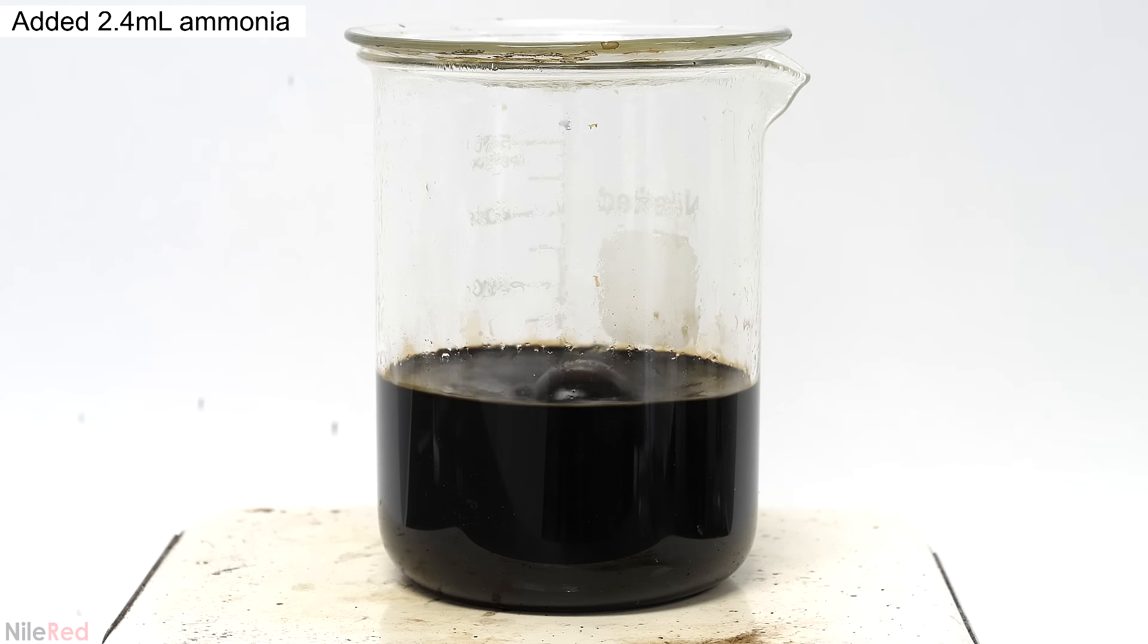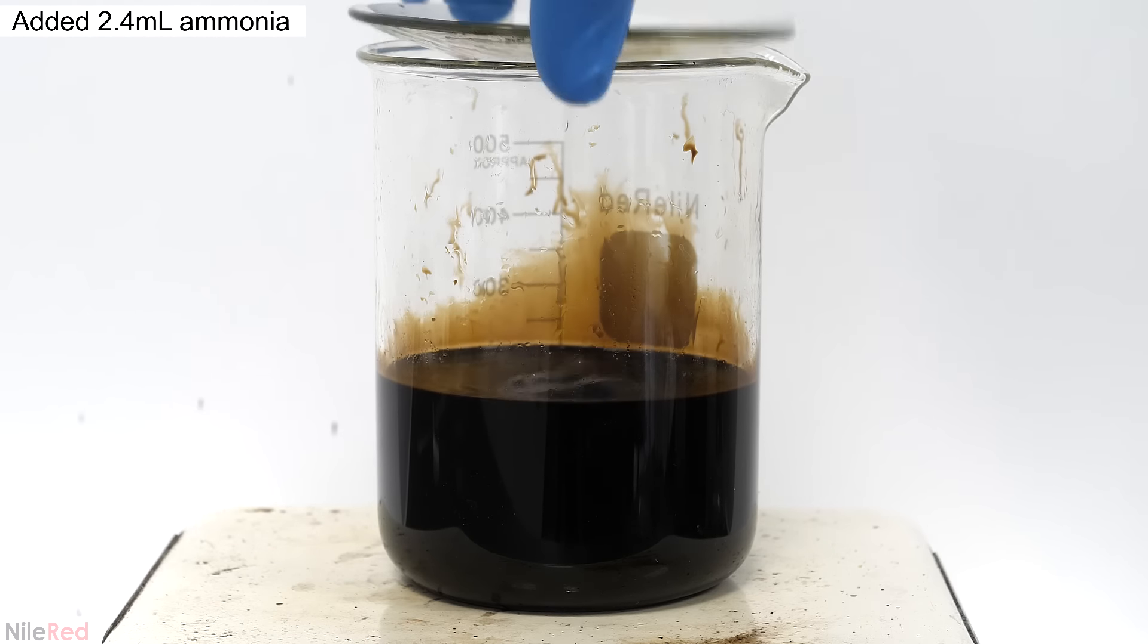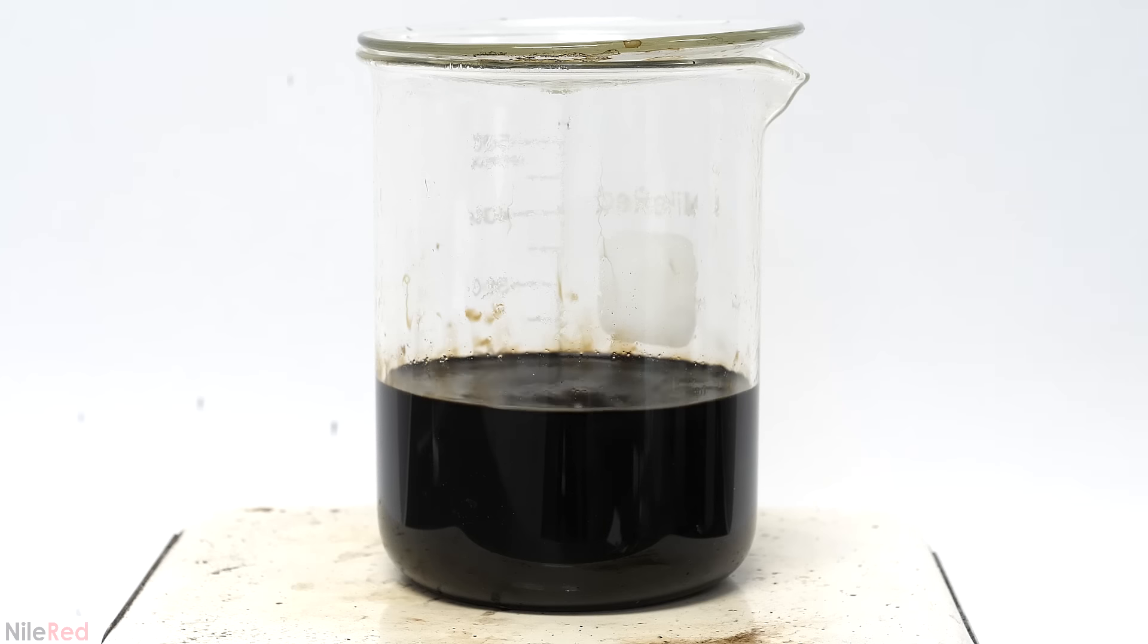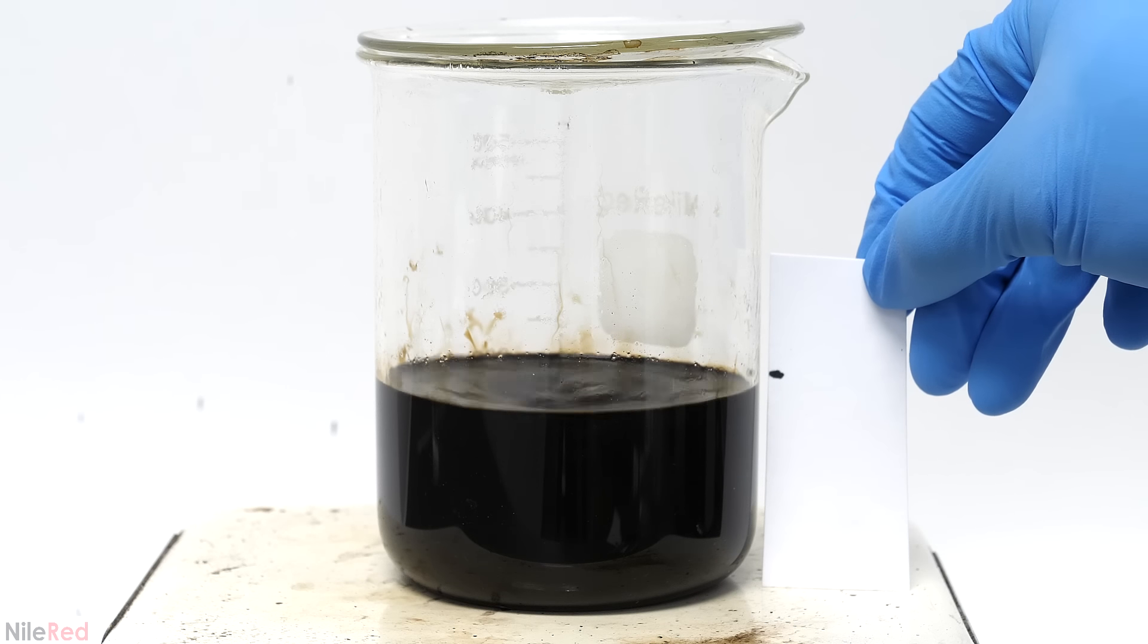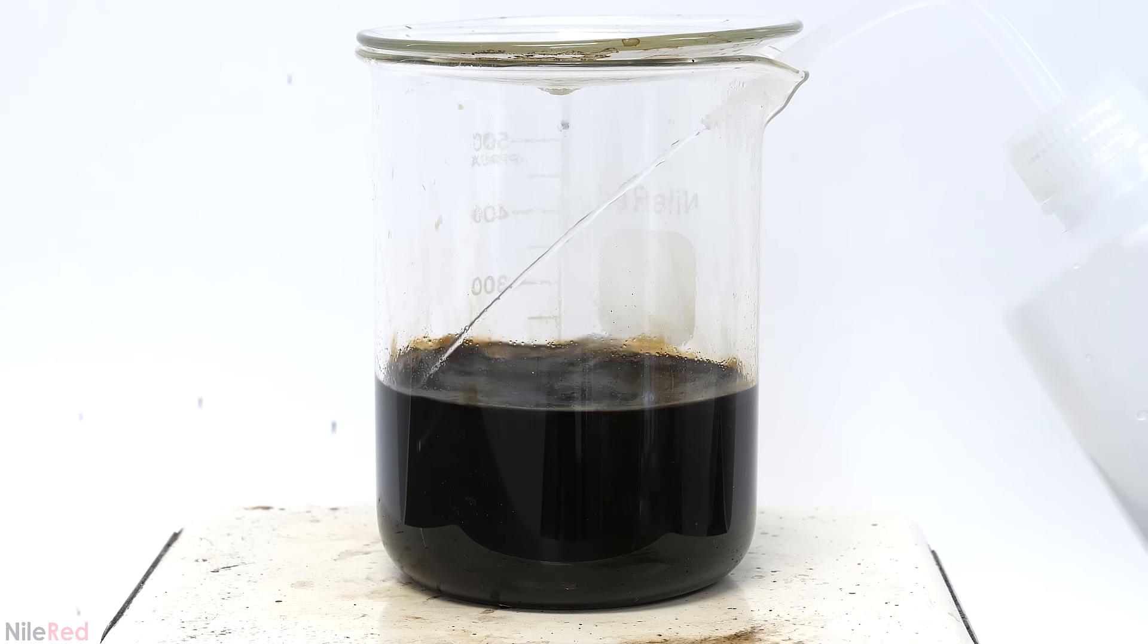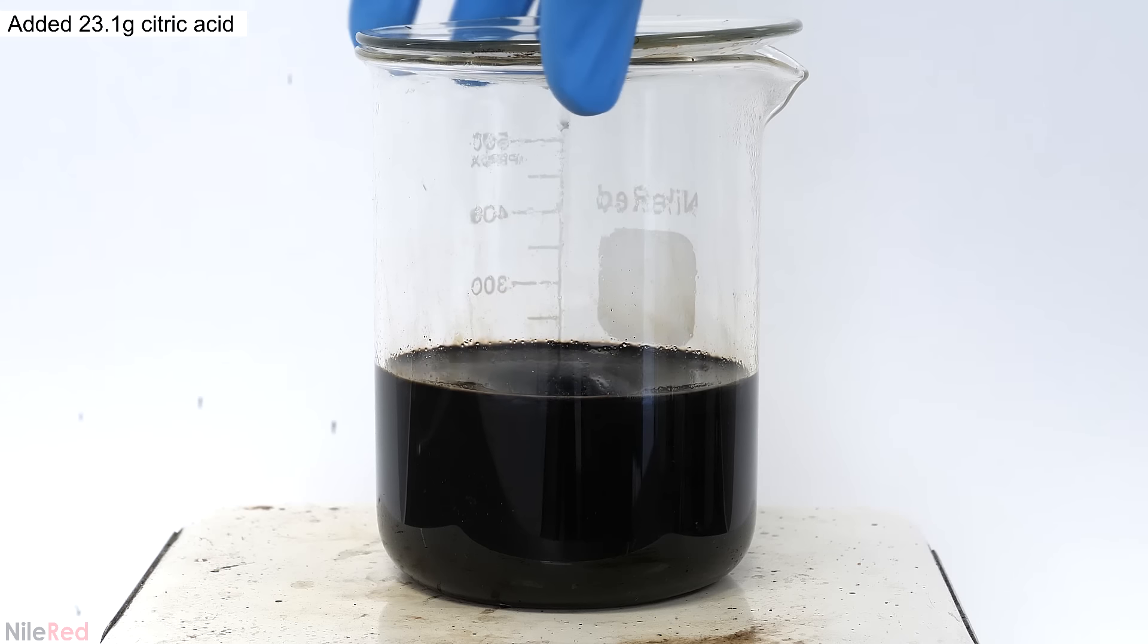I brought it back to a hard boil and I added 2.4 mils of the concentrated ammonia solution. Then I let this boil for another 90 minutes. It was important to keep the volume constant here, and I used a piece of paper to mark the height. I just checked it every five or ten minutes or so and added more water when needed.